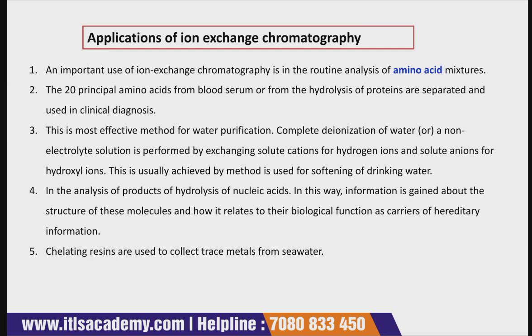As we have studied in the definition also, it is very important in the separation of protein molecules which have different amino acids. So it is basically used in the routine analysis of amino acid mixtures.